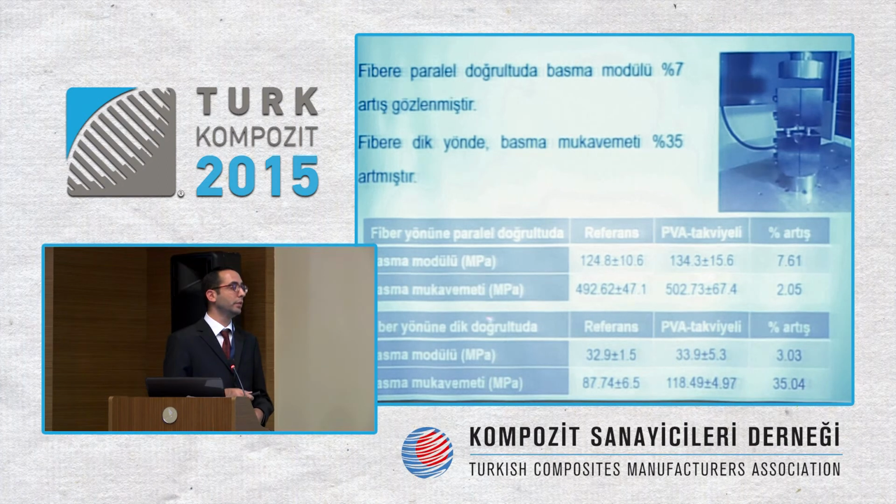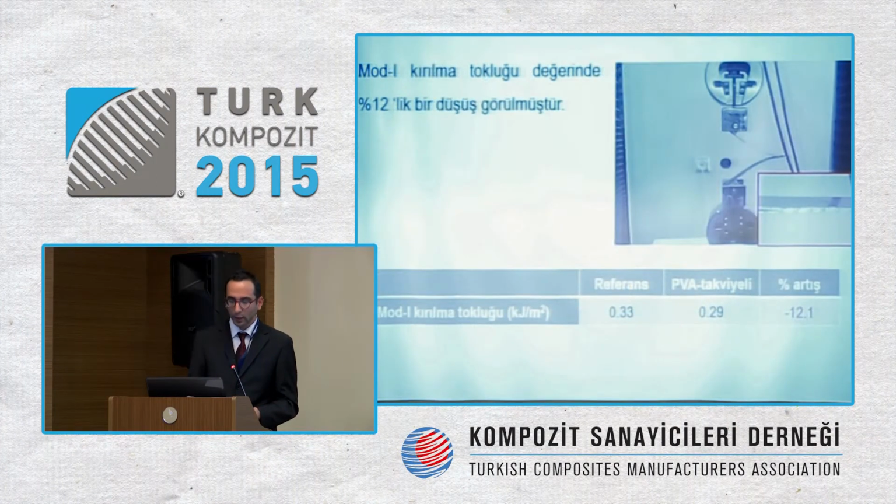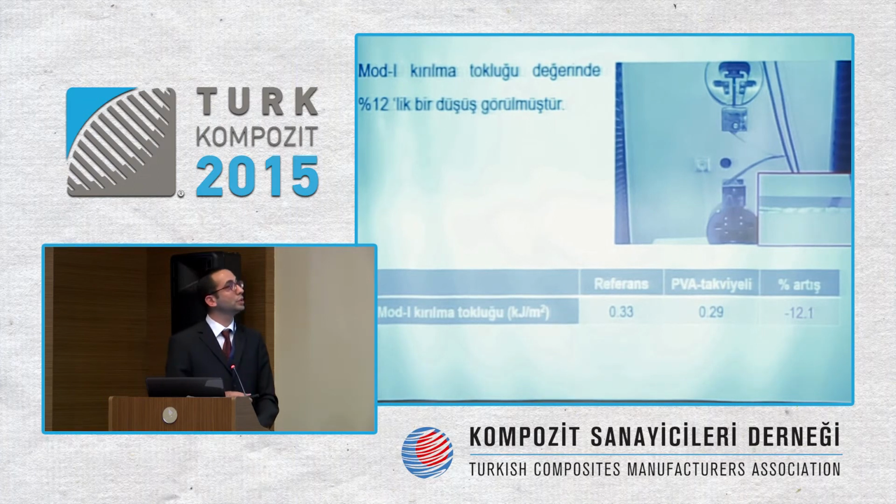The press test was vertical and horizontal to the fiber. As we know, the epoxy is a dominant element. In the horizontal and the parallel one, the increase was 7.61. In the vertical one, in press strength, there was a 35% increase. And in mode 1 breakage test, there was a 12% decrease.